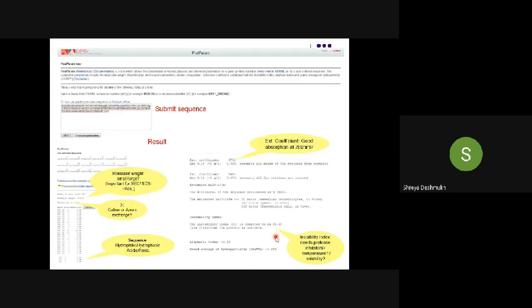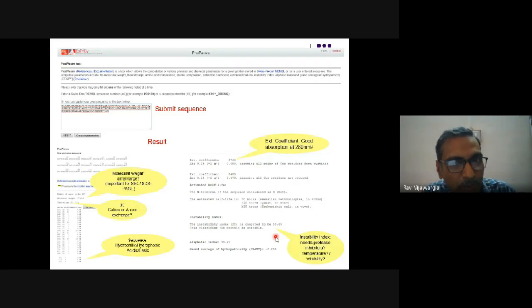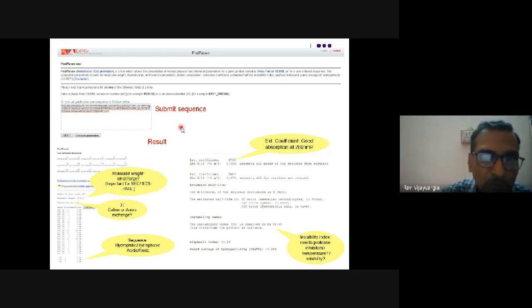Okay, sir. So if you don't know a lot about your protein and you only have the sequence of the protein, there are several tools which might help you get more information about its features. This is one such tool. There are other tools also, but this is one of the popular ones. It is available online and it is free. You can just Google for ProtParam, and it will take you to the ExPASy website. In this window you can paste your protein sequence, submit it, and within a few seconds you will get this result.